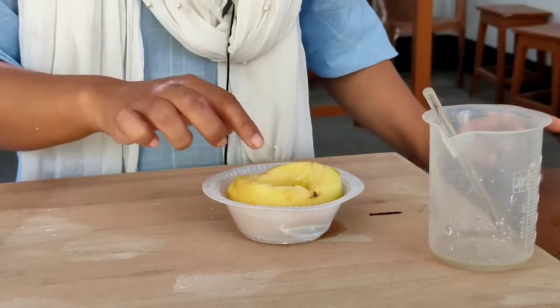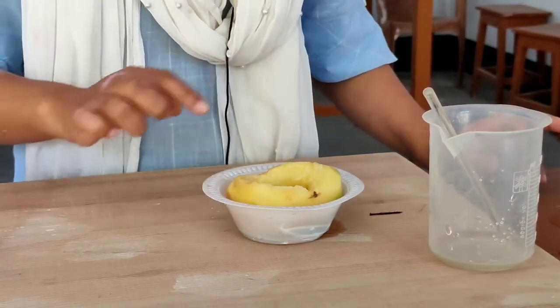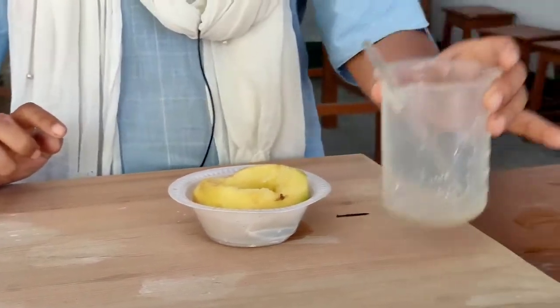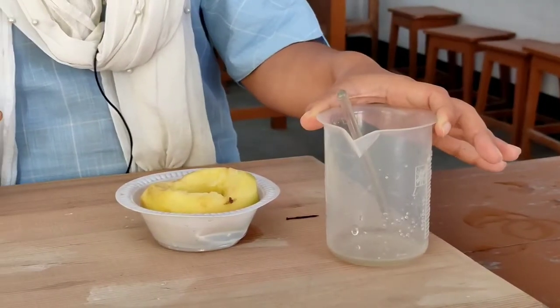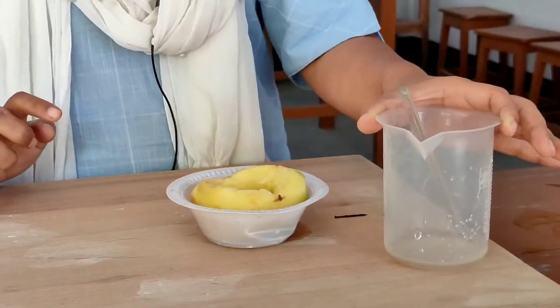Now if you look at this potato, I have drilled a hole in between, and then I have taken water and added sugar to it and made a water sugar solution. Okay, I have made a water sugar solution here. Now first let's carry on with diffusion.